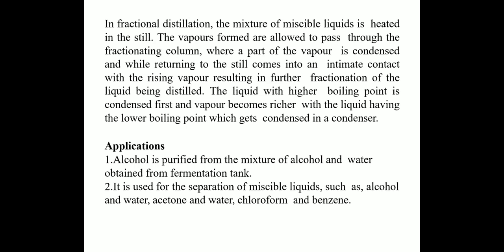The liquid with high boiling point is condensed first and the vapor becomes richer with the liquid having the lower boiling point, which gets condensed in the condenser.